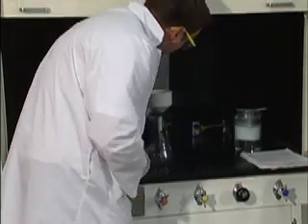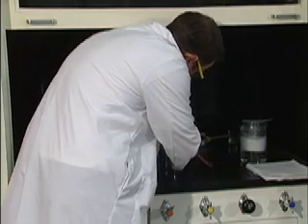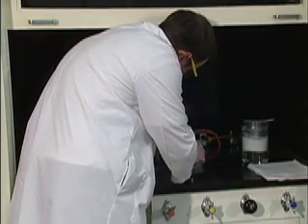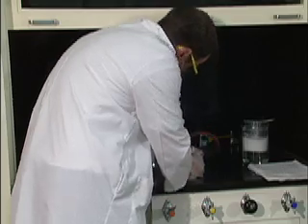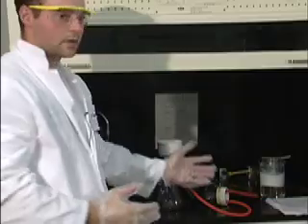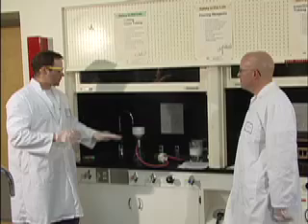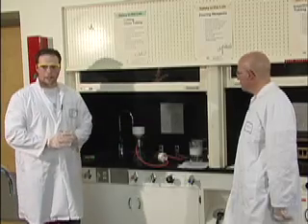So you're going to place one end of the hose on the trap. Just figure out which one's the vacuum. One end of the hose goes on the trap, and one end of the hose goes into the vacuum. So that's sucking air is what that's doing. Exactly. The other hose goes to the other end of the trap, and then towards the funnel, the sidearm flask. So it sets up something like this. Now this trap, it doesn't matter if it's straight up and down or on its side, it's a sealed trap, it'll be fine exactly like that.